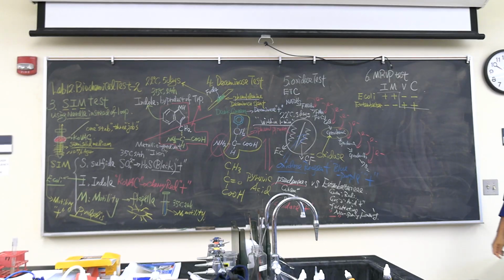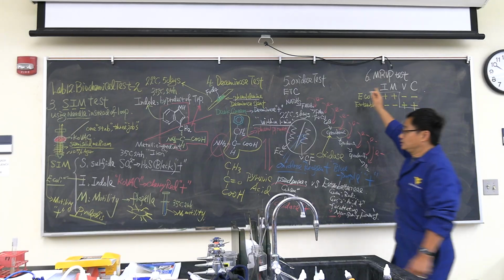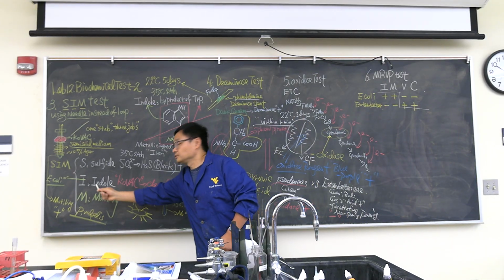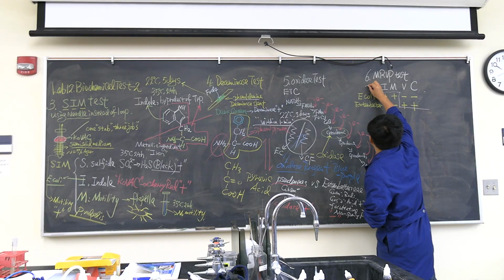What this looks like, sticky ends, remember? DNA sequencing, okay? So let's talk about that. What are these things? What is indole? What does I mean? I is indole. We already talked about it. So I is indole.